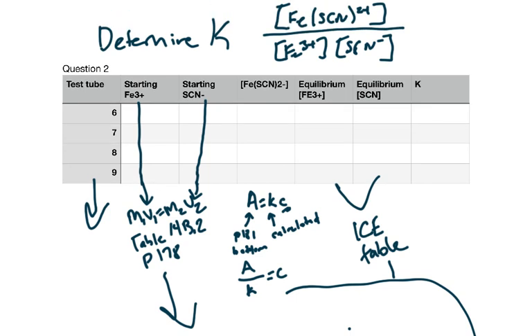Then your K value. Now you know everything. It comes from these 3 columns, which go into that K from the equation up there. Your K values should all be pretty similar to each other. That's why at the bottom it says mean. That is your mean K value.